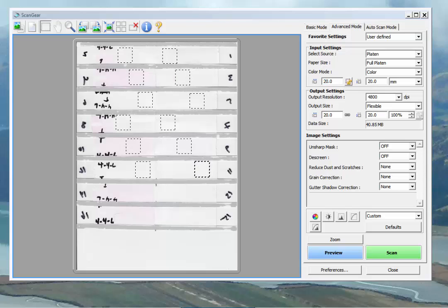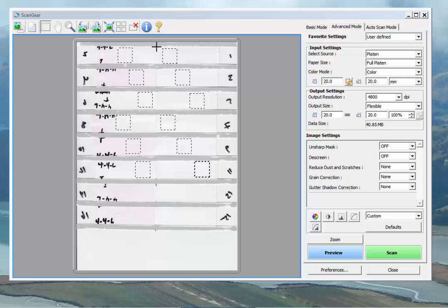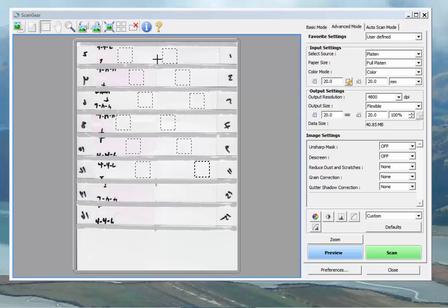So we've gone ahead and set all our scan areas here. One of the differences between the Epson and the Canon is the Canon scans in batches. And so it will actually only allow, at the resolution we're running, it's only going to allow 12 total scan areas because that's the maximum batch size in megabytes that it will allow. So you see I've set the platen up to handle more cards. But if you're scanning a front and back, in this case we've taken a long card, folded it in half, and then put it into the canopy. So on our left side are all of our tops. You can see the labels from the cards as well. On the right side are the bottom sides of the collectors. So that's handy when you unfold it. You can just lay it in the scanner together and get a top and a bottom in a pair, and you know where you're at.